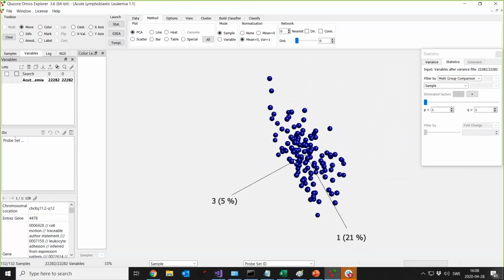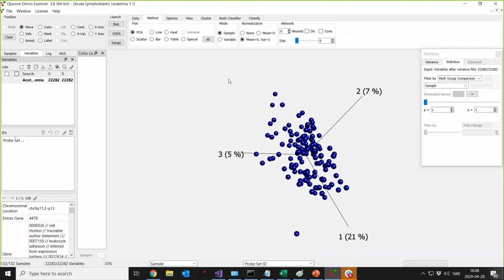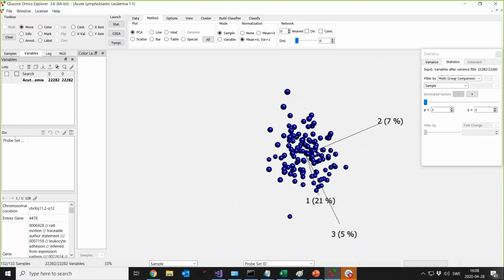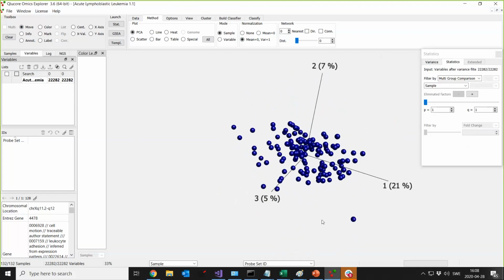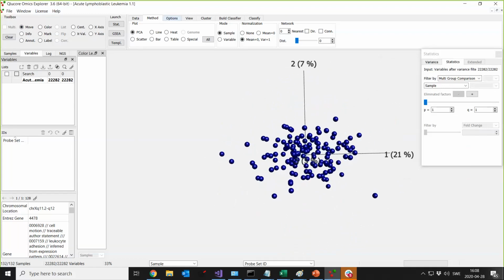This is very useful because when you do exploratory analysis and want to see what's going on, being able to turn things around and use your human vision to gauge distances and things like that can be very, very useful. As you see, it's very fast. We're using accelerated 3D graphics here, a standard feature on modern computers. So that was the sample view.